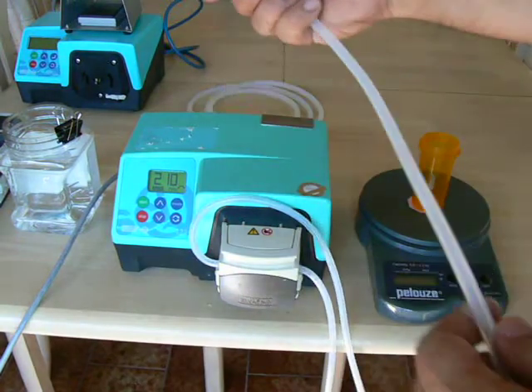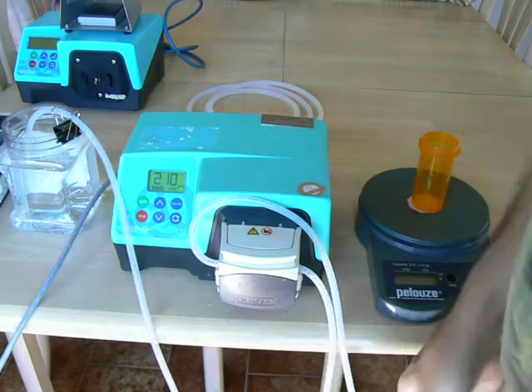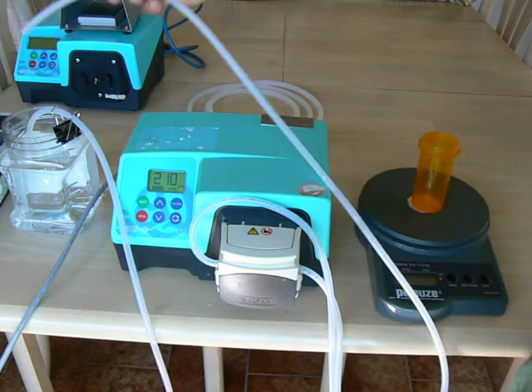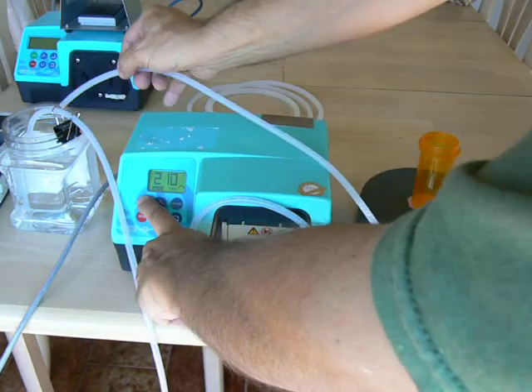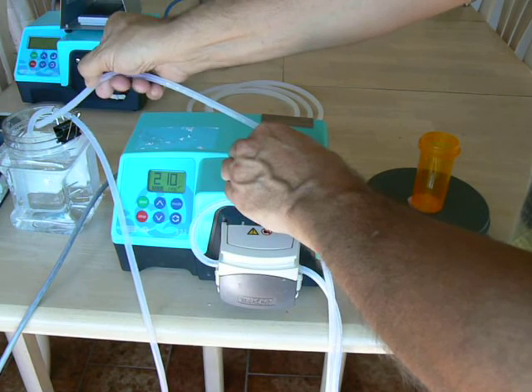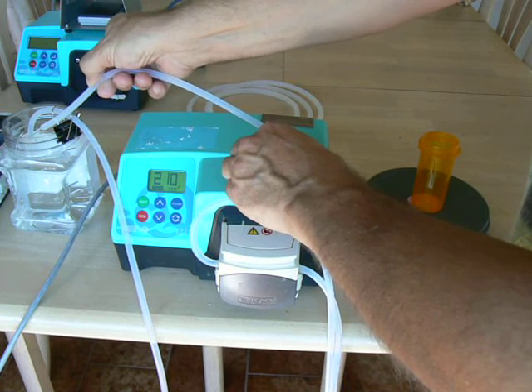We'll pump clockwise for this demo. We'll get the tubing into the reservoir, and in order to prime the pump, we'll put both tubes in the same reservoir. Hopefully you can see the flow — and there you go, now it's primed.